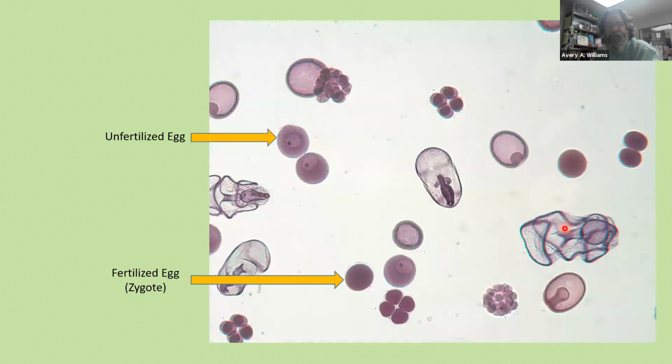So look at this. These are all different individuals, okay? Beginning with an unfertilized egg. Now, an unfertilized human egg would look a little bit different than this, but this is what the starfish egg looks like before it's fertilized. You can recognize it, it's about this big. This is magnified about 100 times under the microscope. Here's the cell, here's the nucleus and nucleolus.